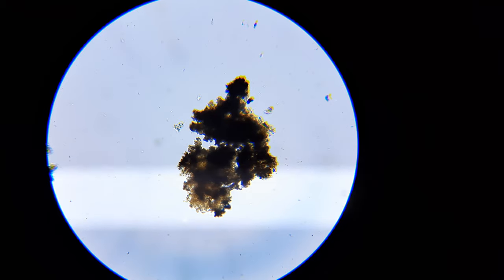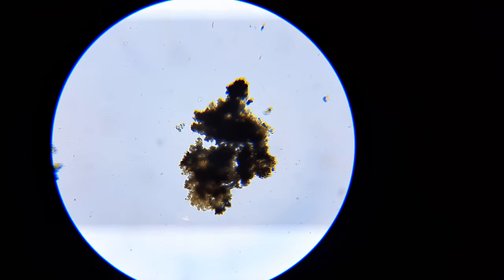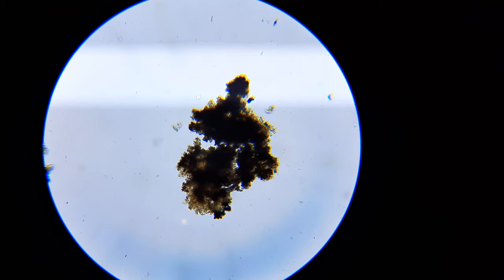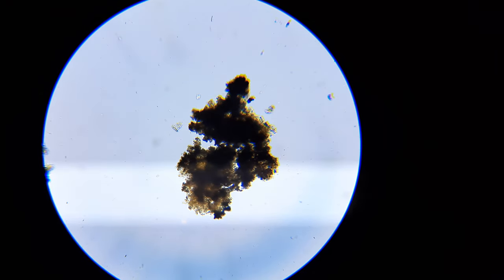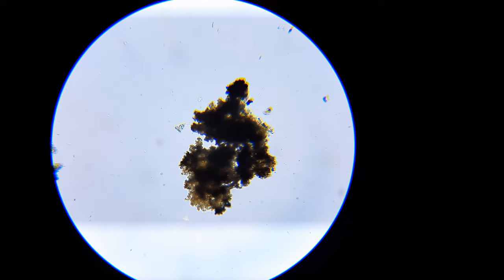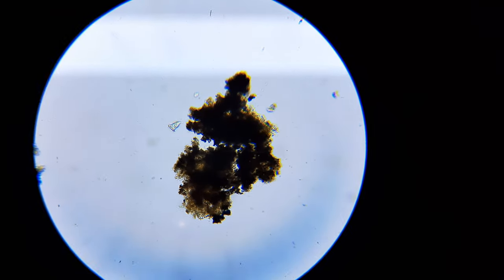Okay, that's it for now. I'm calling this 'Toilet Tank Treasures' because this is a sample of the scum inside our toilet tank. We have a gray water flush toilet.